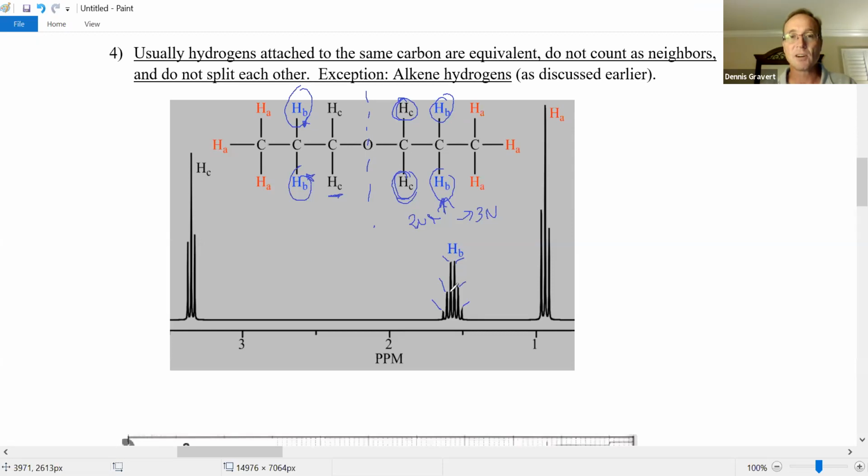And they're kind of level, although this one does point this way. Peak A is pointing to the left. Peak C is kind of pointing to the right. There you go. They're pointing at their neighbors.